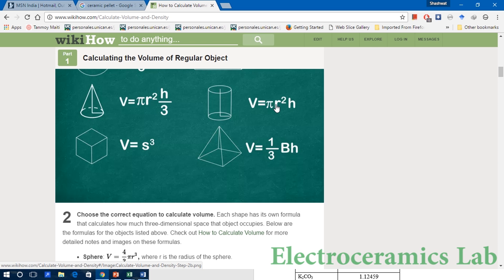The radius r can be easily obtained using slide calipers or vernier calipers, and the height h can be obtained using a screw gauge.